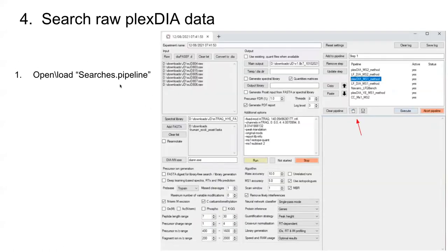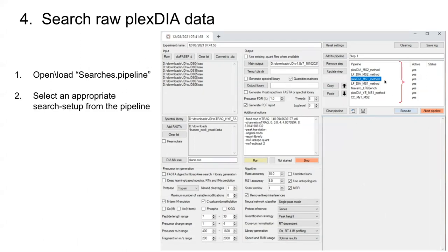Now let's say you'd like to search some raw data. You'll open this searches.pipeline, which is the other pipeline we have in our MassIVE repository. It's going to populate all of these different experimental setups that we did for searching all the different Plex DIA datasets. If we just clicked on this one, this is all the data we generated using what we call a V1 method — MS1 optimized.